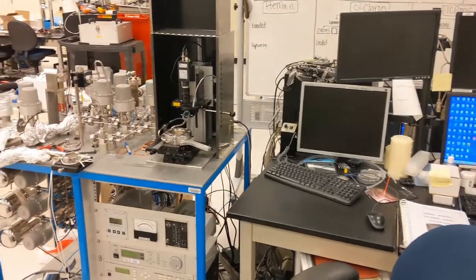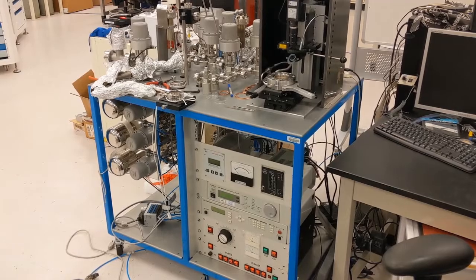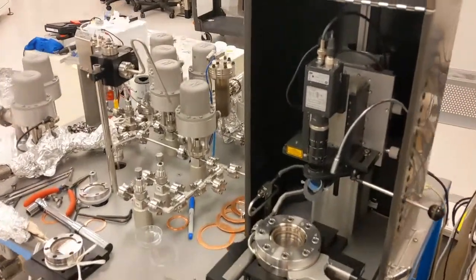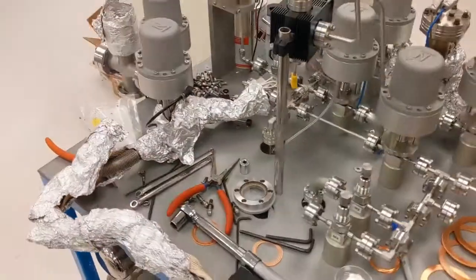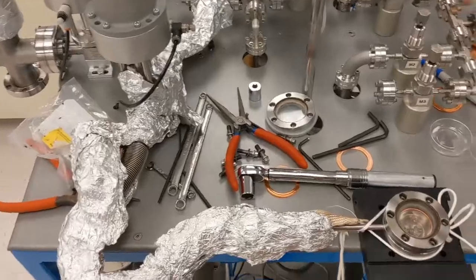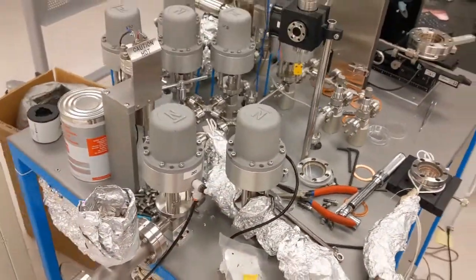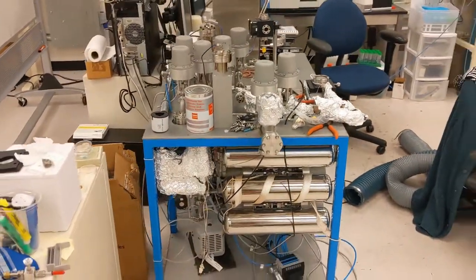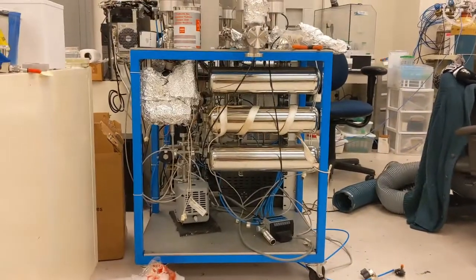This is the Alphachron. It is a quadrupole mass spectrometer, and we use this to measure helium isotopes. We use this in conjunction with the ICP-MS to do uranium, thorium, helium dating, and we have 2 different ways that we can do this. Firstly, we can do the conventional method where we load zircon or apatite or other helium-bearing minerals into niobium tubes, and then we degas them using an infrared laser.